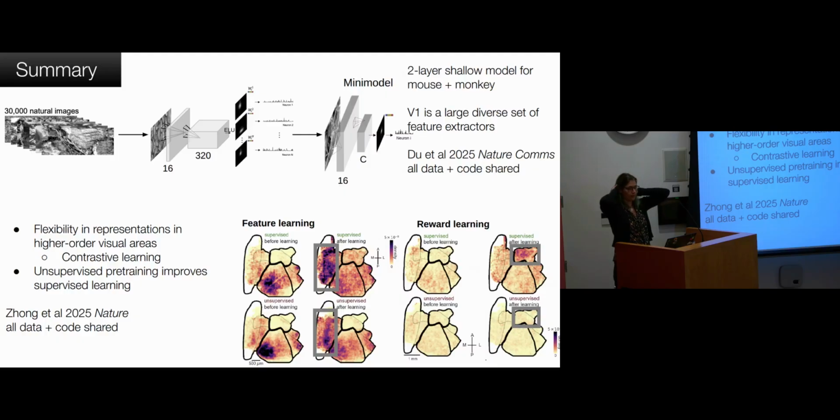Gotcha. And then a second question is just in terms of your newest release, because you have the sparsity model and the other one. I was just curious if you have a simplistic explanation of the difference between those two algorithms. Yeah, so the sparsity algorithm is looking for sparse sources in the data, and we find that works the best in most cases. It doesn't have any prior on what the shapes of the cells should look like or anything like that. Well, it's looking for correlated pixels, basically, in these squares that we sum. And it's just finding things that look like that.